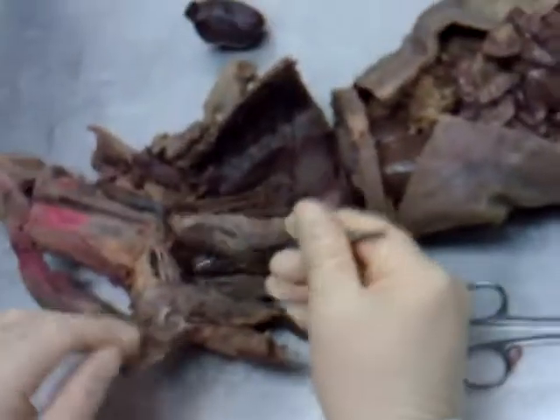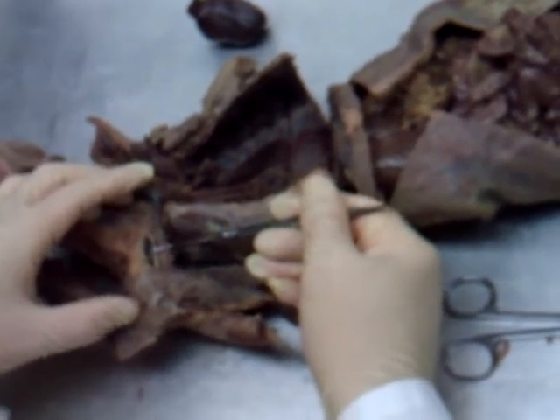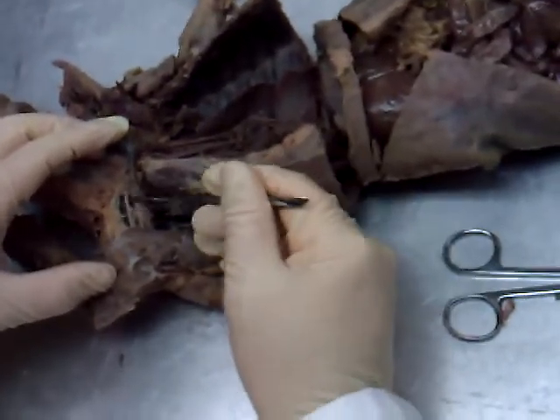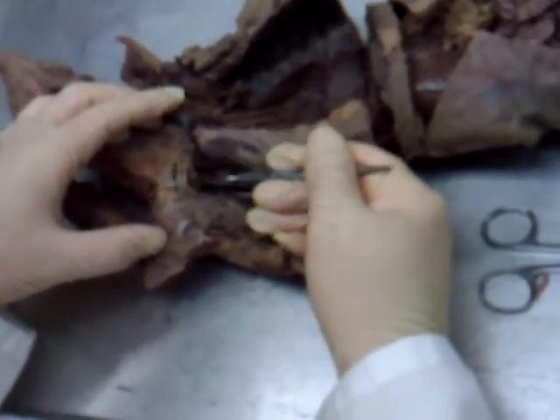Here in the mink's underarm region, now we've crossed where the ribs are. We see an artery and vein right in here. The artery would be the axillary artery and the vein is the axillary vein — so this would be the right axillary artery and right axillary vein. The nerves still here would be the mink's brachial plexus — all the nerves in the underarm region.